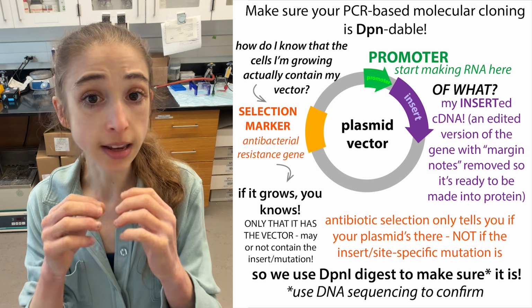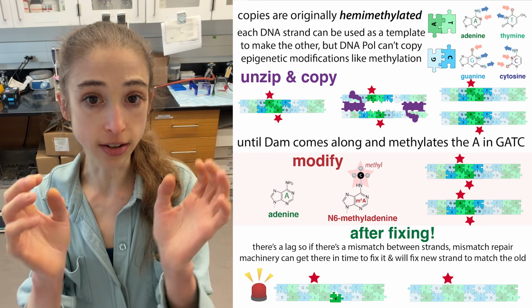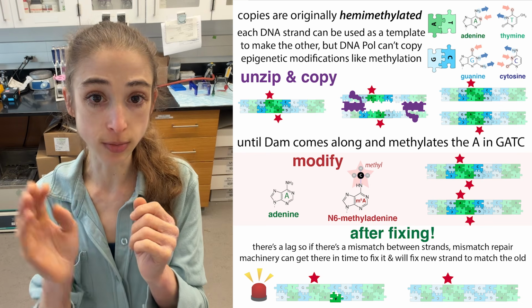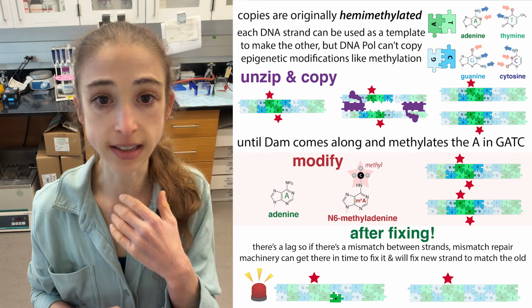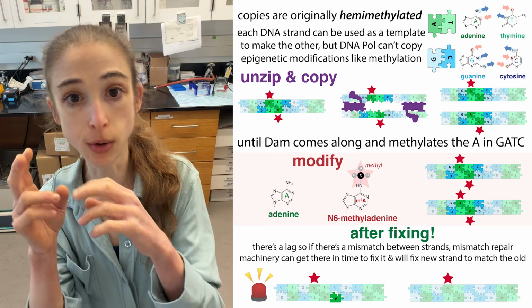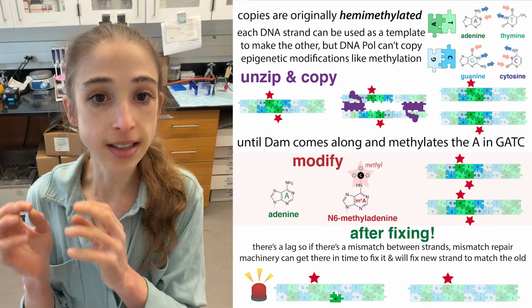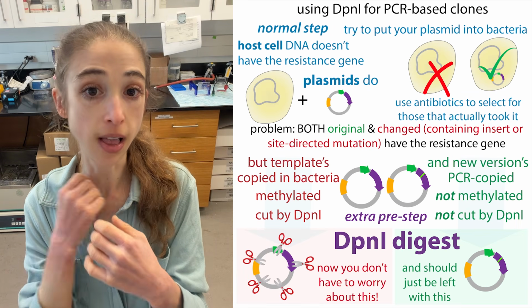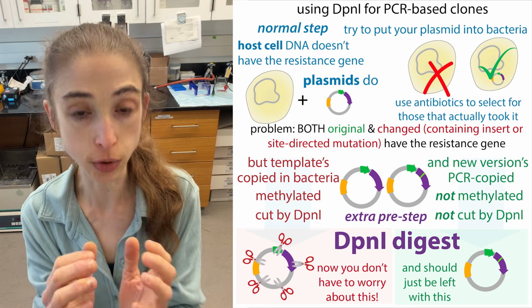Now, when DNA is copied inside of bacteria, the bacteria methylate their DNA, or at least some strains of them do. They add methyl groups to their DNA. And that has a few different functions, including allowing them to see which strand was old and which was new, and identifying it as their self, and all this stuff. This enzyme, however, from this other bacteria says, okay, I see that you have methylated DNA. I know you're foreign. I chew you up.